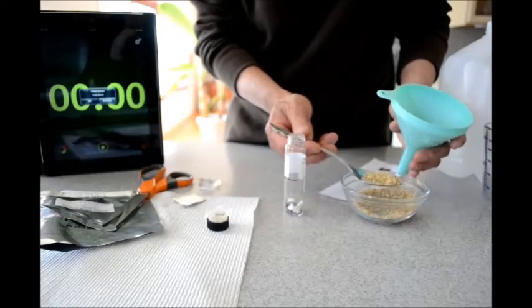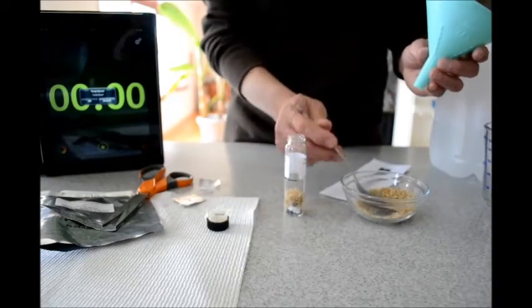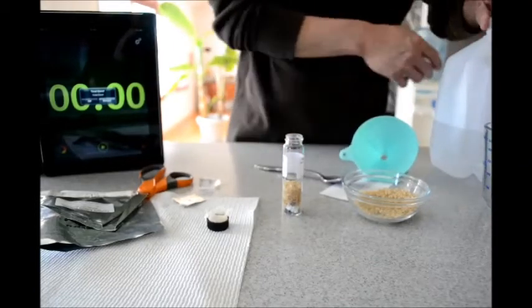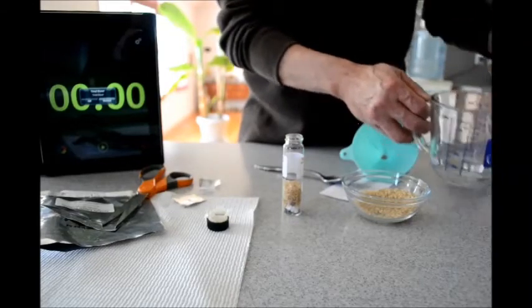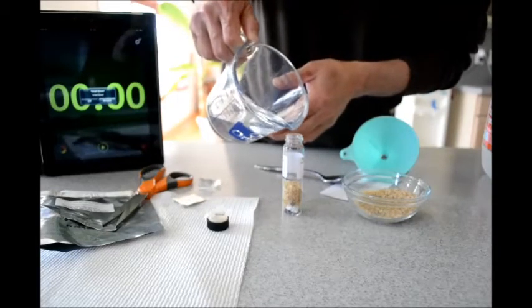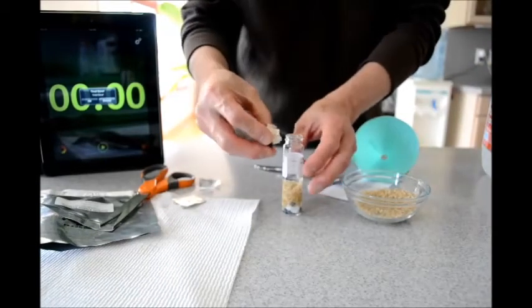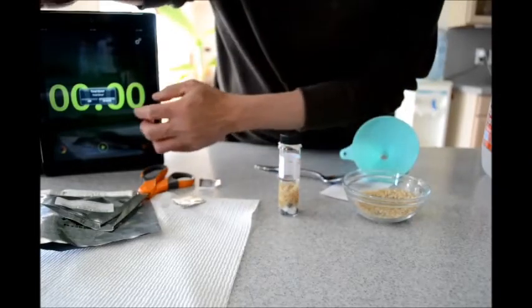It doesn't have to be exact — about a tablespoon should do it. Just a little bit more; this is about a tablespoon. Then I need to put an equivalent amount of distilled water, fill it to the mark here. That should do it. Replace the filter paper into the cap and screw this in.